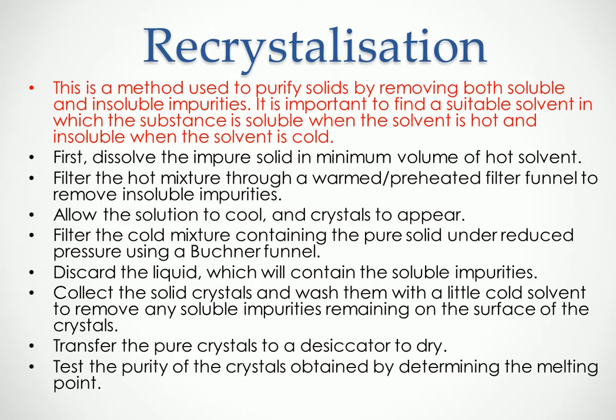So now you've obtained your pure crystals that are dry and do not contain any impurities. We just need to do one last thing, and that is test the purity of the crystals, and that is done by determining the melting point. So this is just one thing you're gonna do after you've obtained your crystal, but we don't know how pure it is. So we just look at the melting point of that crystal just by putting it in a capillary tube and melting it in a test tube and just measuring the temperature once it melts.